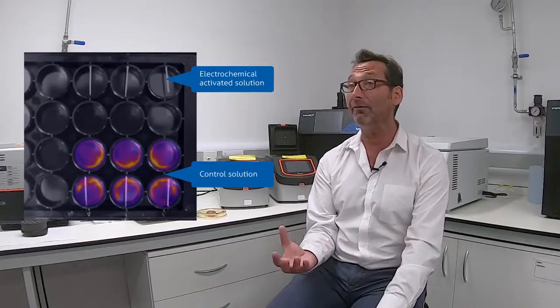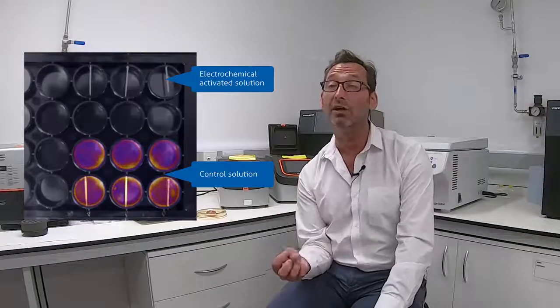In some of the work we've done, it's pretty apparent that many disinfectants do not have a residual quality about them or do not kill enough bacteria in the initial application, and that results in regrowth. What we've discovered with using ECAS is that that regrowth is very, very minimal.